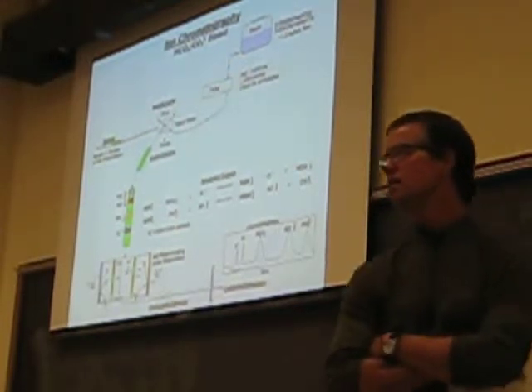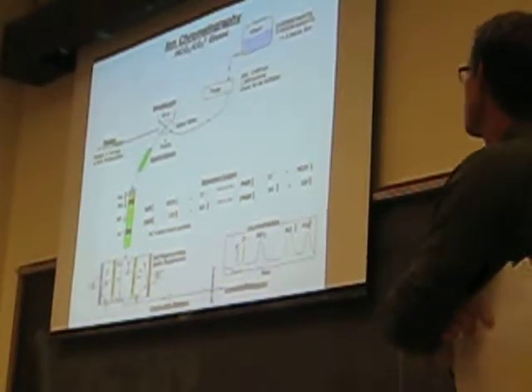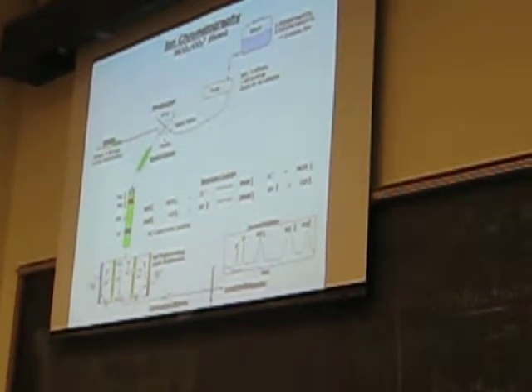Do we have to keep that in mind when we use the length of the column to calculate? No, because the guard column doesn't really facilitate separation. Why doesn't it separate out the anion if it has the quaternary ammonium ions in it? Because it's so small. So it's meant to be there, not to change anything. For a guard column, you should always match the stationary phase of your analytical column, so that you don't have competing kinds of processes. But it's so small that not much can happen over that space before the sample moves through.